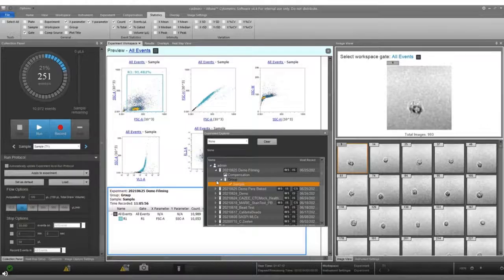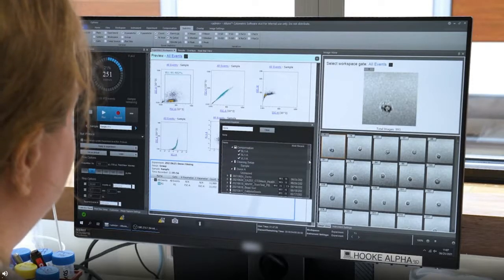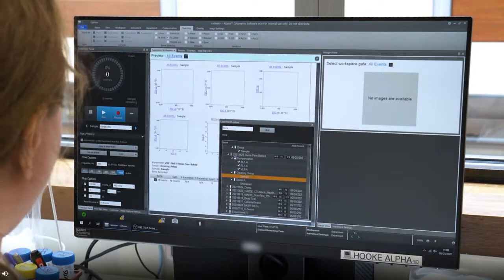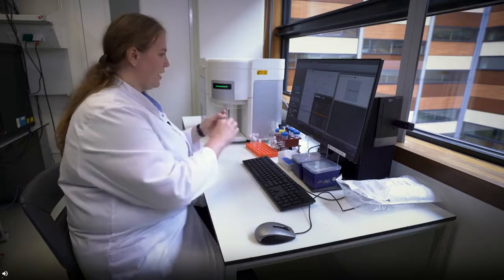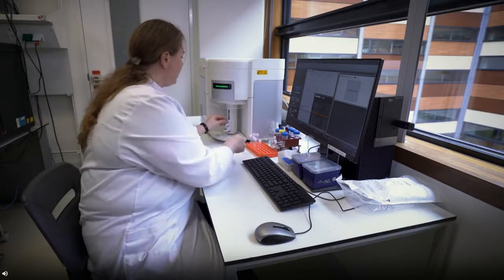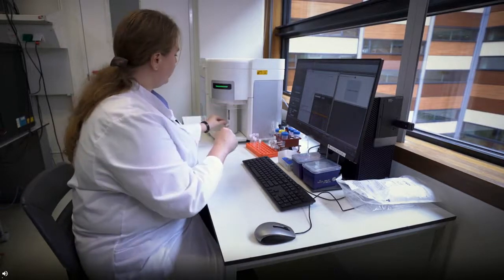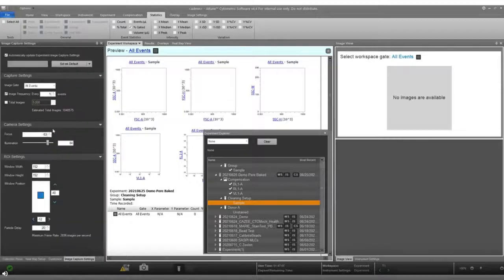And so this is kind of our, if you were on a cooking show, this is the point where we've assembled everything and put it in the oven. And then, of course, this would be our dish that we have pulled out of the oven, since I called it demo pre-baked. So this will look very familiar, but in this system or in this layout, I can run our full stain sample, even though I have switched experiments. Since the focus of the camera changes from day to day, our image capture settings have still retained, even though we've fully changed experiments.